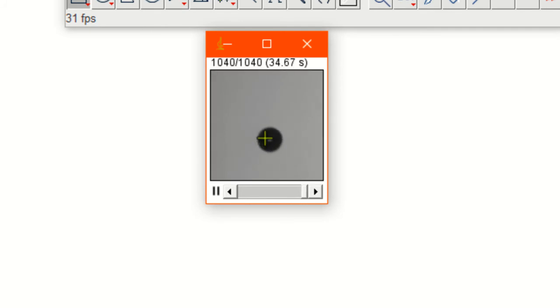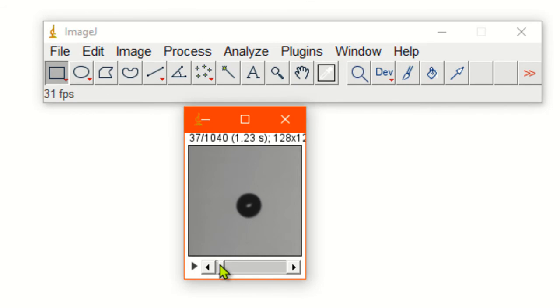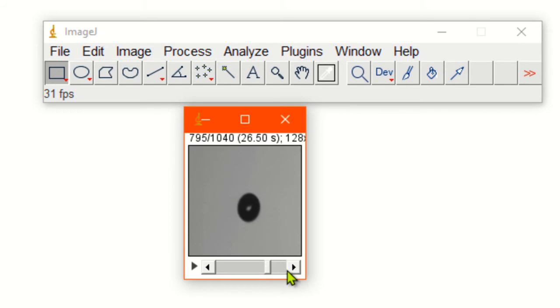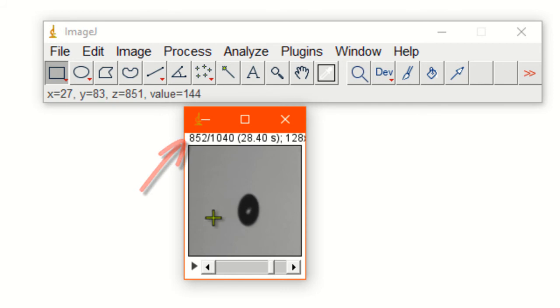Finally, when deformation reaches a critical point, it breaks by forming a shed and relaxes back to its spherical shape. Now suppose we're interested in finding out the drop outline corresponding to frame number 852.